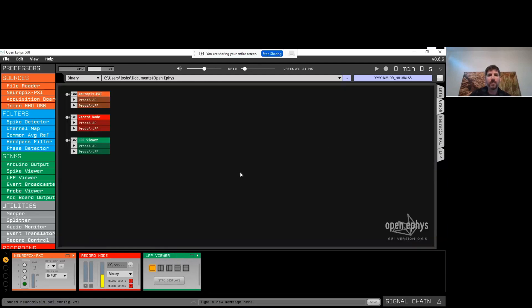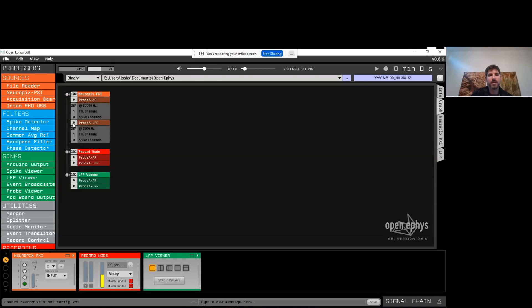We can take a more detailed look at the signal chain in the graph tab, where we can see the data streams coming through. The Neuropixels PXI plugin generates two data streams: one for the AP band sampled at 30 kilohertz, and one for the LFP band sampled at 2.5 kilohertz, and these propagate through the rest of the signal chain. If we were using a Neuropixels 2.0 probe, there would only be one wide band data stream.